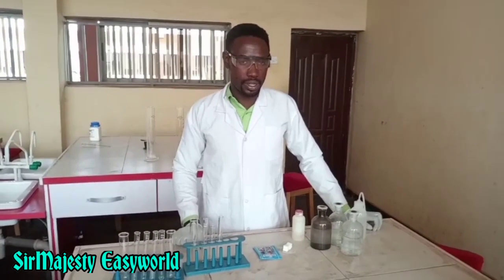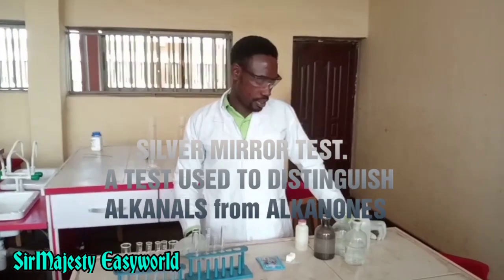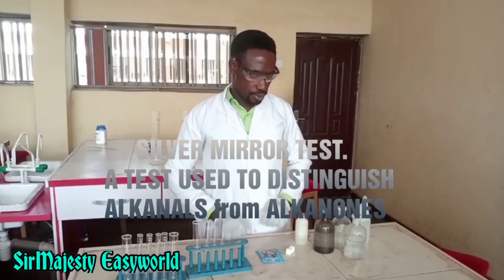This is Samajesty Easy World Science Channel. Today we will run a test known as the silver mirror test. That is a test to distinguish aldehydes from ketones.